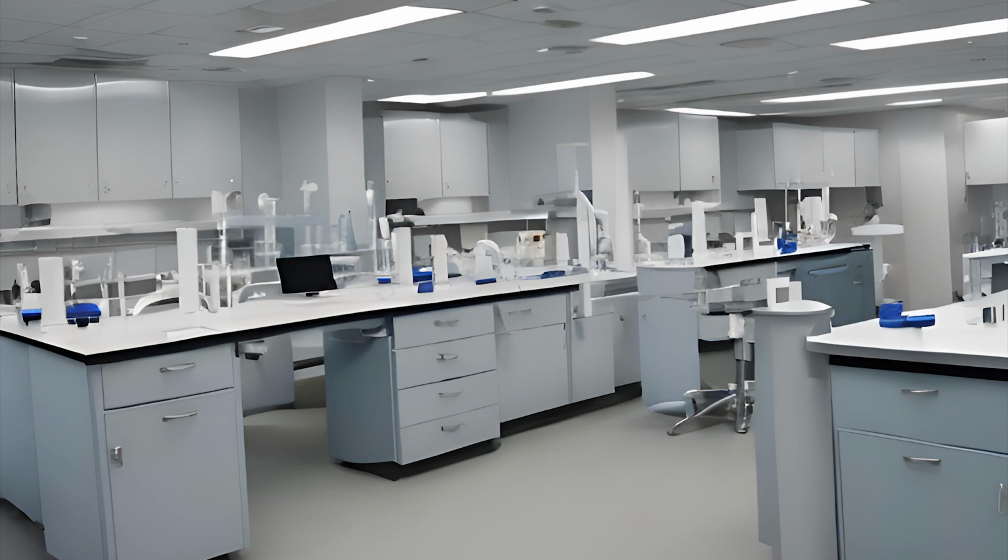When making your aliquots, you need to be careful to avoid mislabeling your samples. Especially if you're working with a large number of samples, it can be easy to lose track of where you're at. So you want to label as you go. Otherwise, you could be working on something, one of your coworkers could come up and ask you a question and distract you, and you look away and you go back to what you were doing, and then you accidentally put the aliquot into the wrong container. You have to be cognizant and aware of that possibility so that you set up your workflow in a way to minimize those risks. You also want to prevent mixing up plasma or serum specimens.